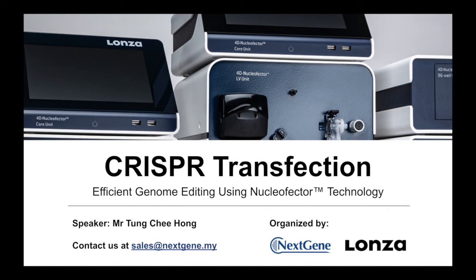Oh, okay. So, Selina, thanks for your question. Yes, the guide RNA has to be designed by you, or in some cases for mammals, for human cells, you can look for a group of scientists called Zhang Feng, ZF, from MIT. They actually designed guide RNA sequences targeting many human genes, and you can look for them from there. Otherwise, you just need to use the designing tools. To name a few, there are several designing tools, and you can find them on the NEB website.